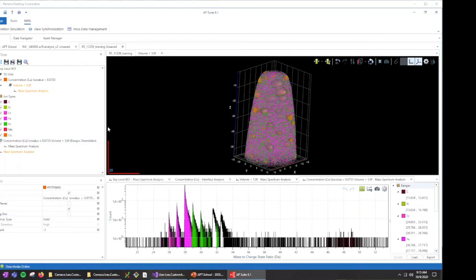All right. That's what I wanted to show with isosurfaces. Let's see, I have another approximately half an hour. Yeah, pretty much. Okay. All right. Let's see here. Don't worry, we're not going to cut you off if you go a couple of minutes over. Oh no, and since I don't have any practical stuff, I wasn't quite sure how long this would go.